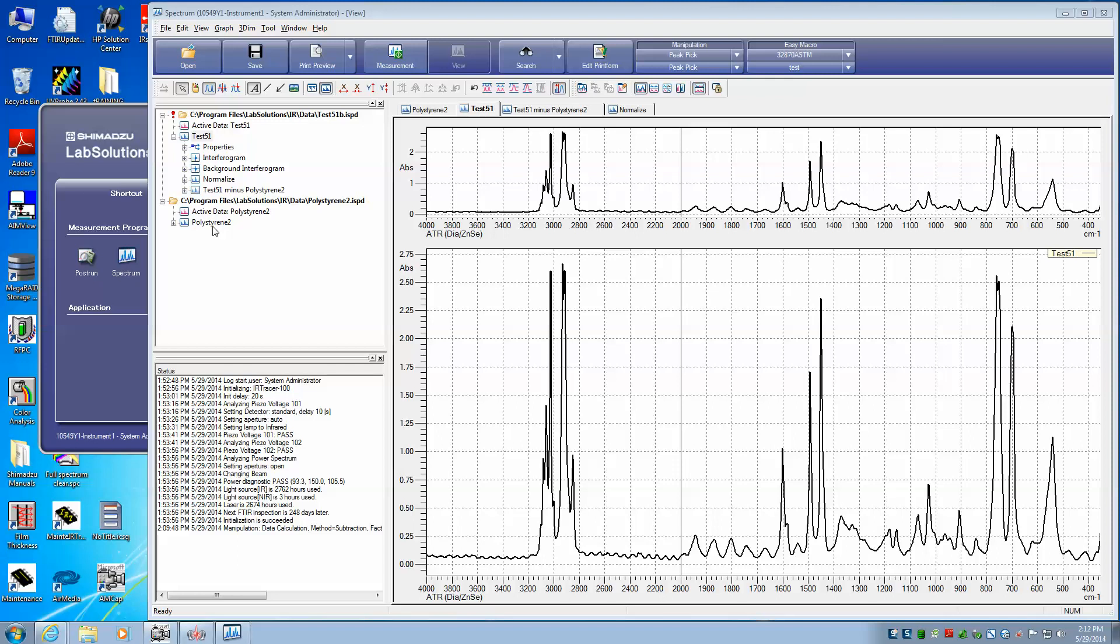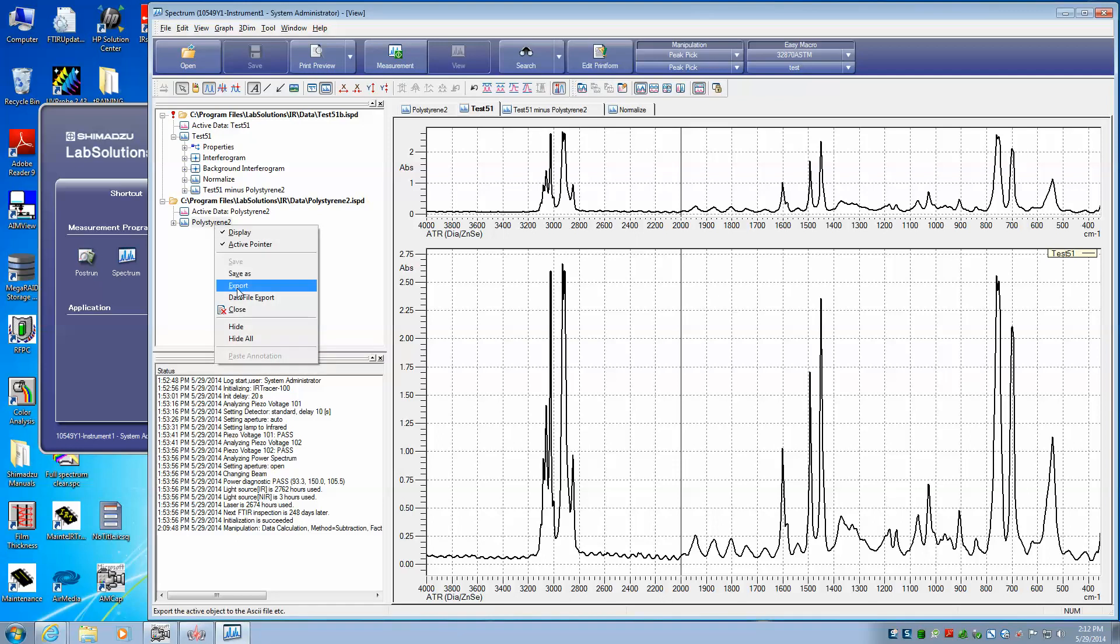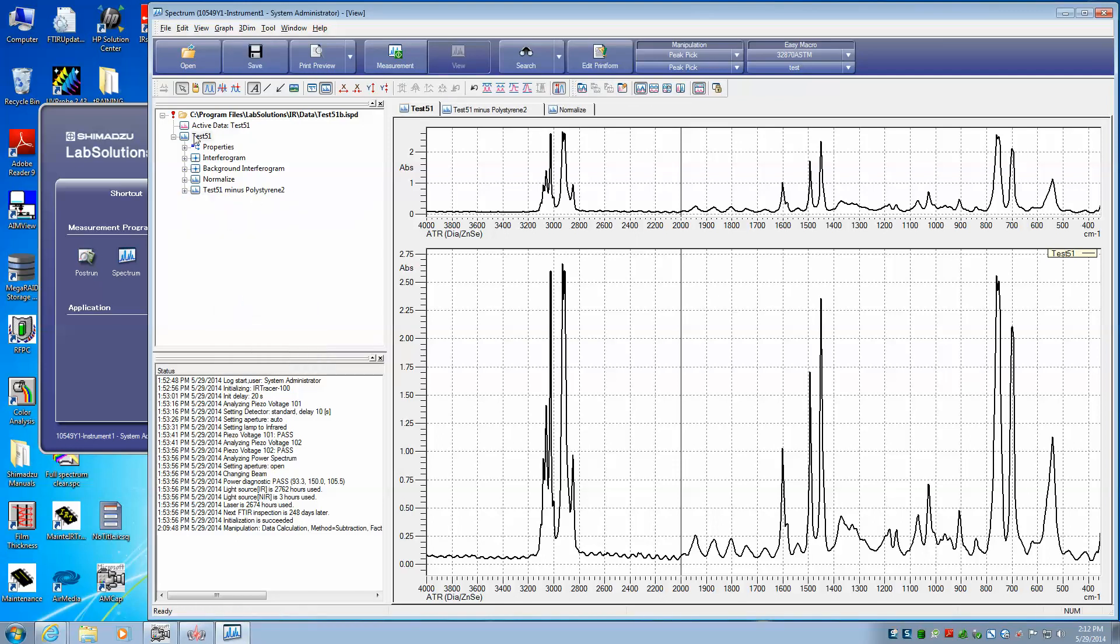Say we no longer want the polystyrene, we can simply remove that by right-clicking on the file name and say close, and that will remove it. So we're left with our test 51.